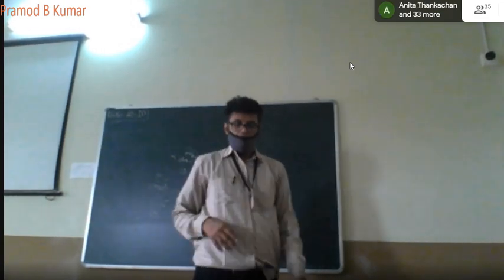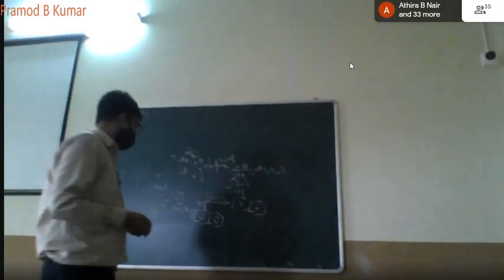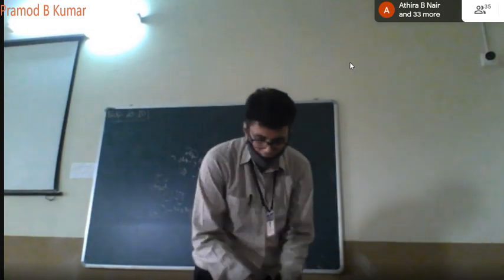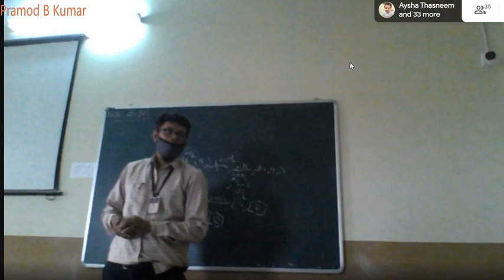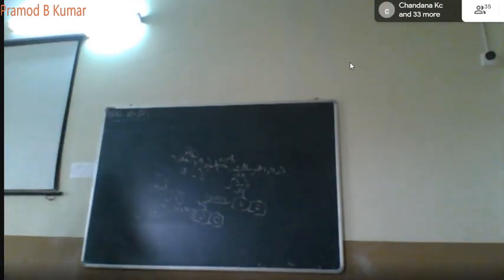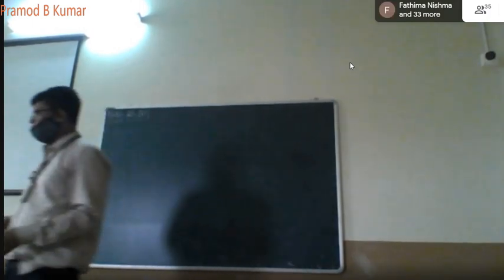So the next reaction is synthesis of benzil from benzoin. What is benzil? It is a diketo compound. It is prepared from benzoin. Benzoin is what? An alpha hydroxy ketone.